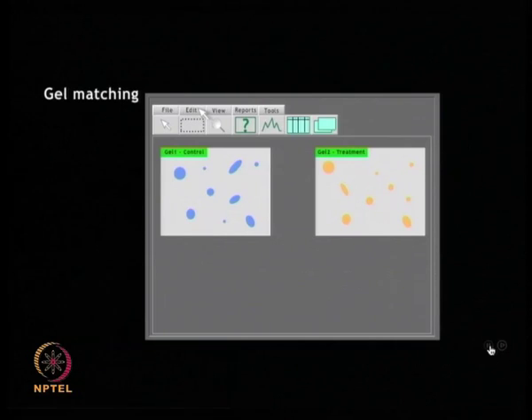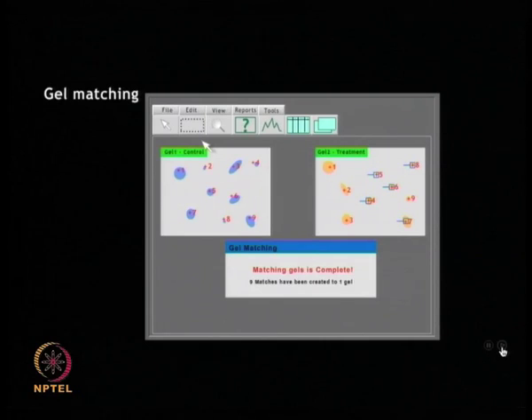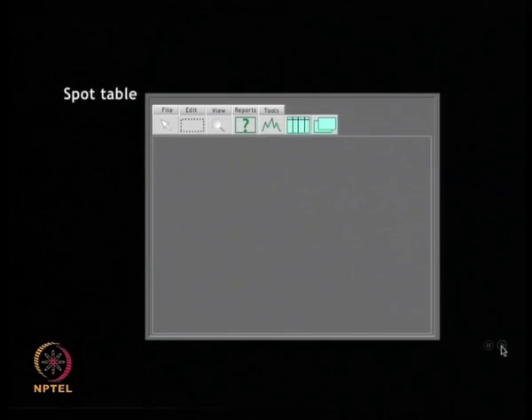Now, I will describe the gel matching. The software facilitates interpretation of the gel images by matching two different gel images which were obtained in your experiment. The matching spots are marked, and after matching is done, any variation in the spot intensity and spot positions can be indicated by the blue lines as shown in the animation. This provides an understanding about the reproducibility across the gels.